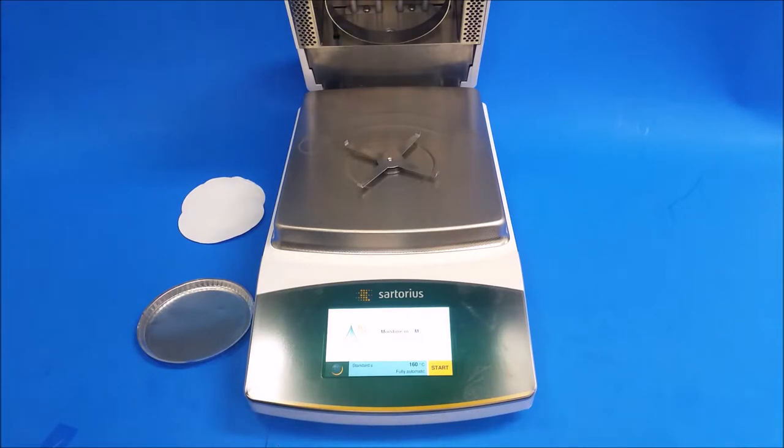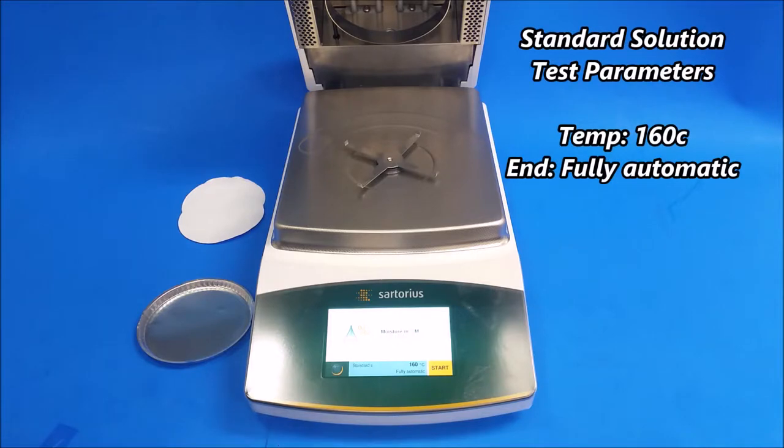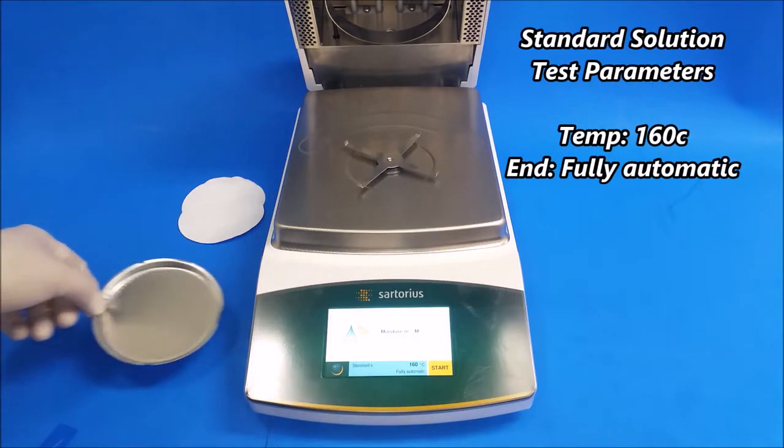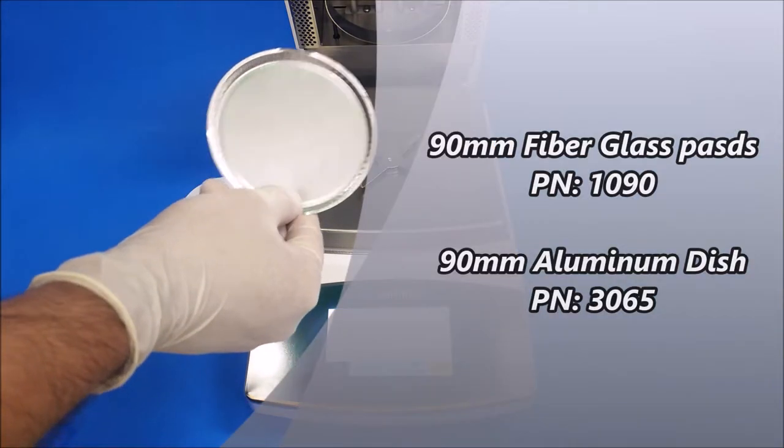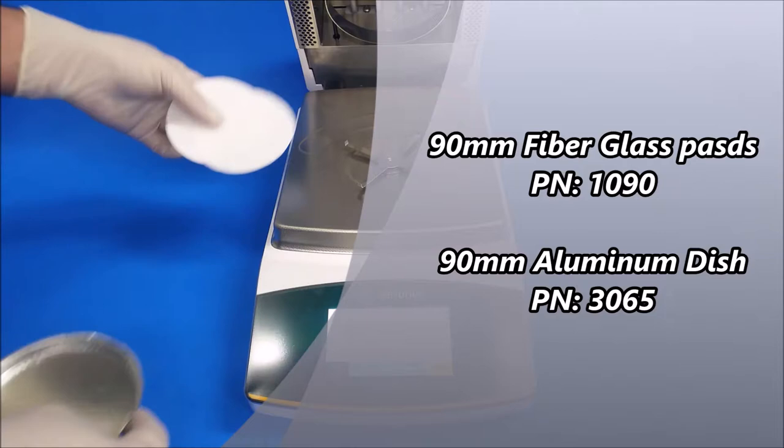Now we're going to run a standard solution test. That's a liquid that we have here. I already set it up in the specifications that we need to run a standard solution. First thing we're going to need is an aluminum dish and two pads.